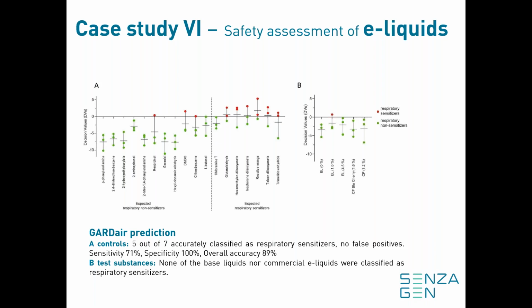So all of these e-liquids were classified as non-respiratory sensitizers in our assay, which I think is quite in line with the expectation from the customers, because these products have all been out on the market and people have been exposed to them without any adverse effect in terms of respiratory sensitization being reported.